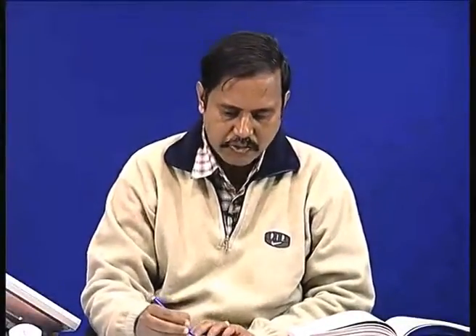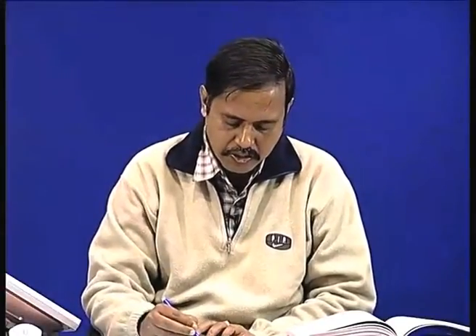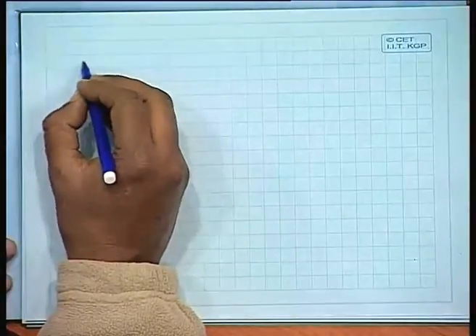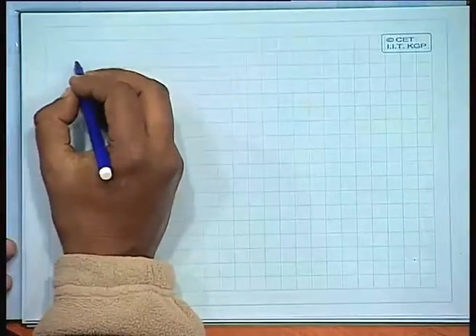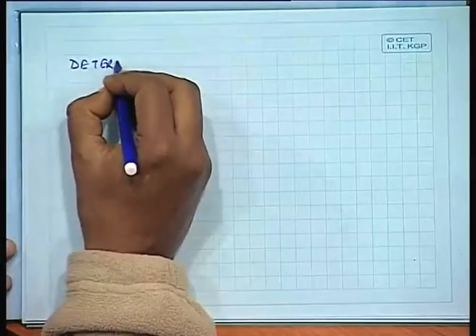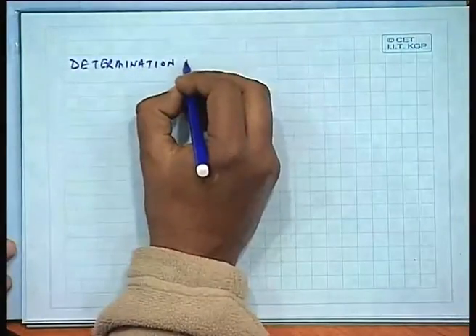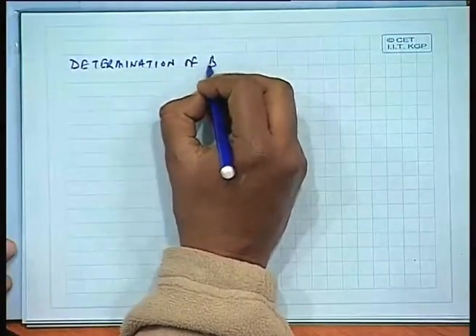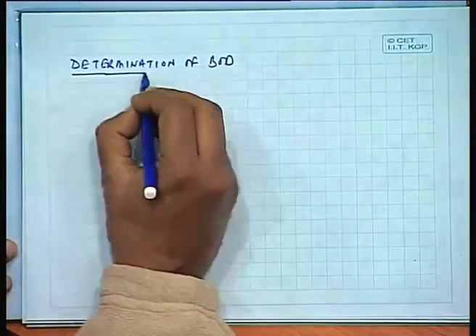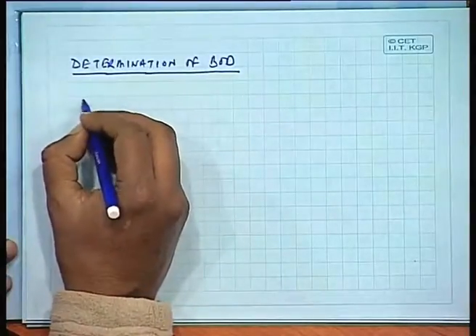We were discussing this BOD, the biochemical oxygen demand. Let us find out, as we have said in the beginning, one important thing: the determination of BOD. The standard procedure, let me do it step by step.